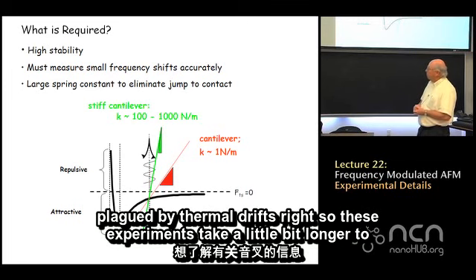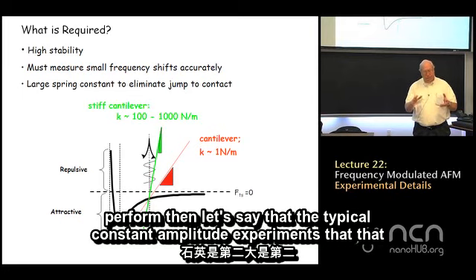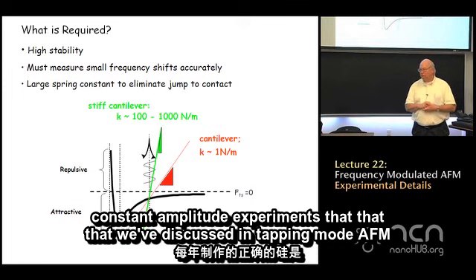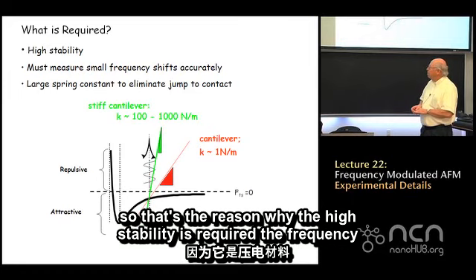So these experiments take a little bit longer to perform than, let's say, the typical constant amplitude experiments that we've discussed in tapping mode AFM. So that's the reason why the high stability is required.